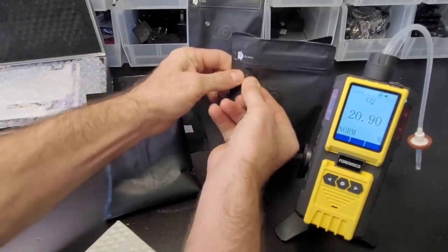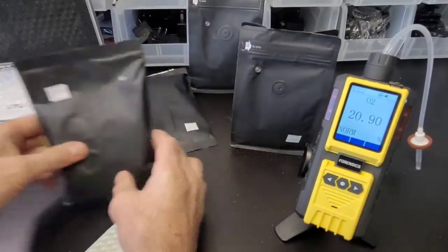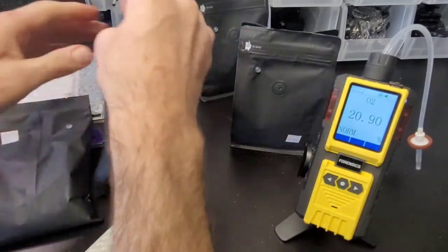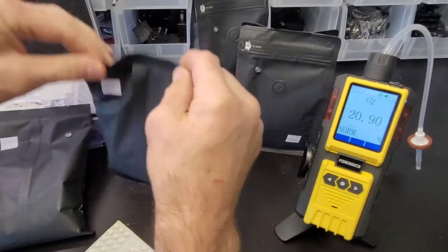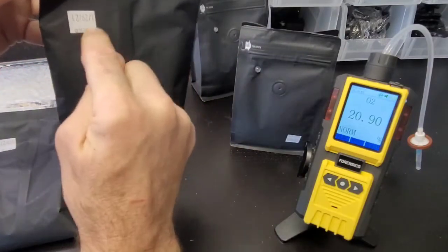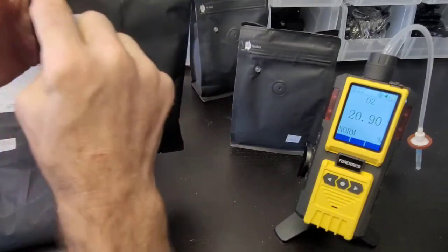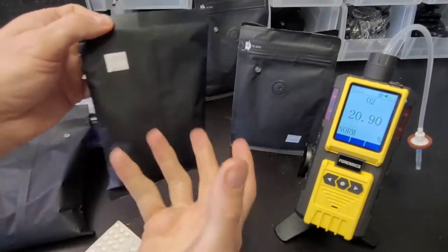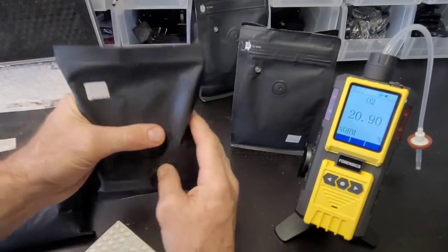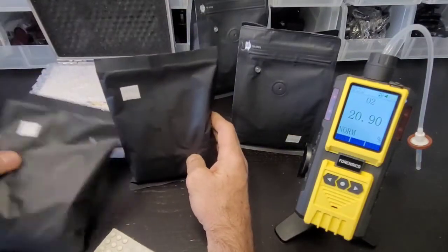Now, what's headspace analysis? The headspace is the air that's remaining in the package. It's the space left on the head of a package - that's why they call it headspace. That's why we call this headspace analysis, folks - we're analyzing the headspace.